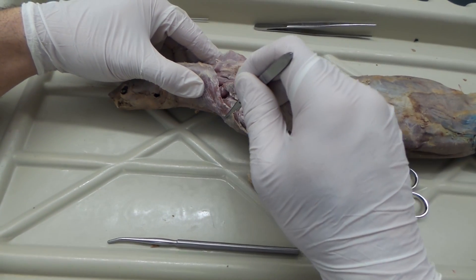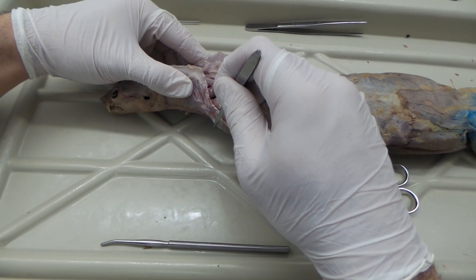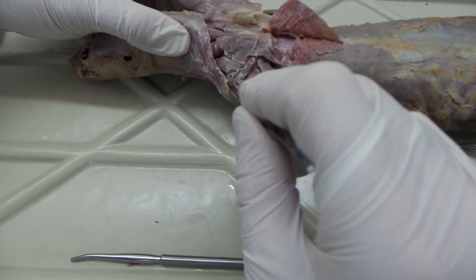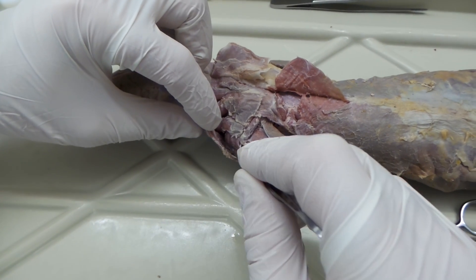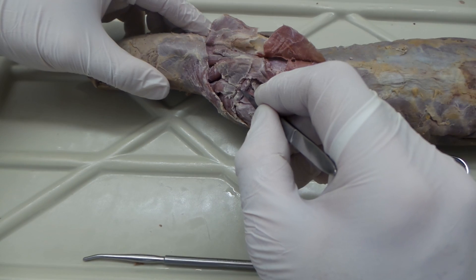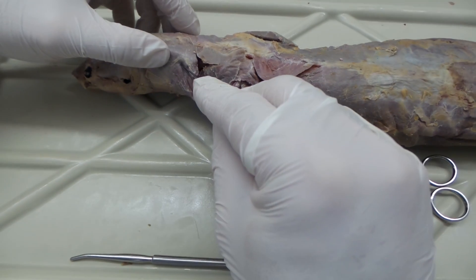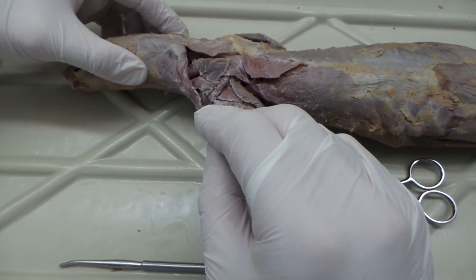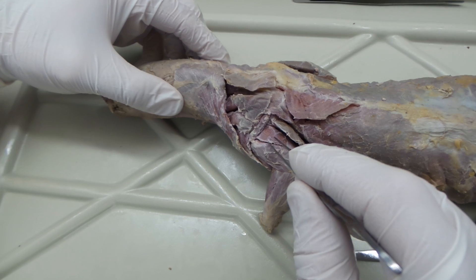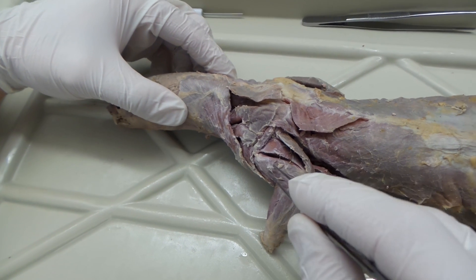From about this point, where the trapezius becomes the deltoid, we have the clavotrapezius transitioning to the clavodeltoid. This little triangular muscle — push down and pull forward — that's the acromiodeltoid. And this little one right here is the spinodeltoid. So we have clavodeltoid, acromiodeltoid, and spinodeltoid. These muscles on the arm — the epitrochlearis and part of the triceps — we'll look at those for exam two.